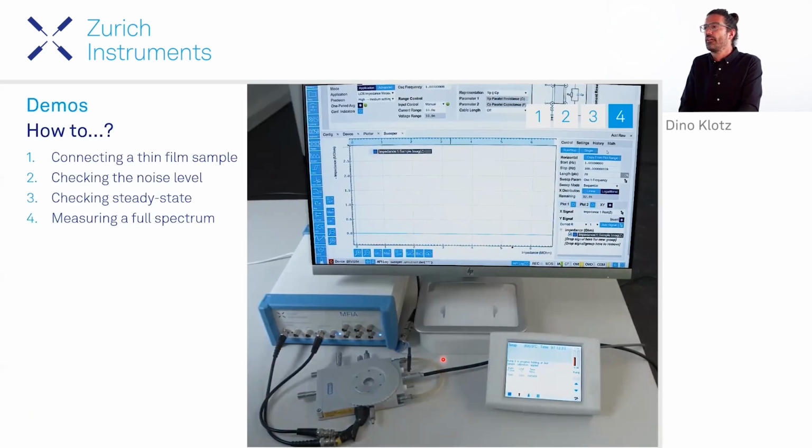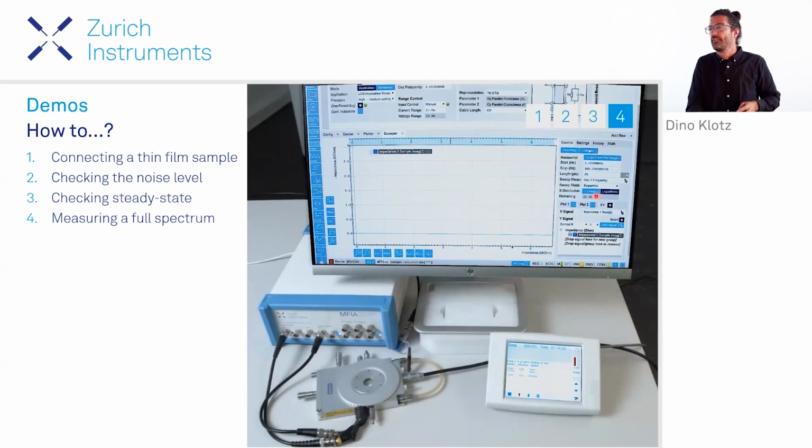And so we go here. The software predicts 32 seconds. You can time it when I push the button. Now it's already a bit too late, but you see we're running down this countdown, and the impedance is forming from low frequencies to high frequencies. And you see, so this is real time.